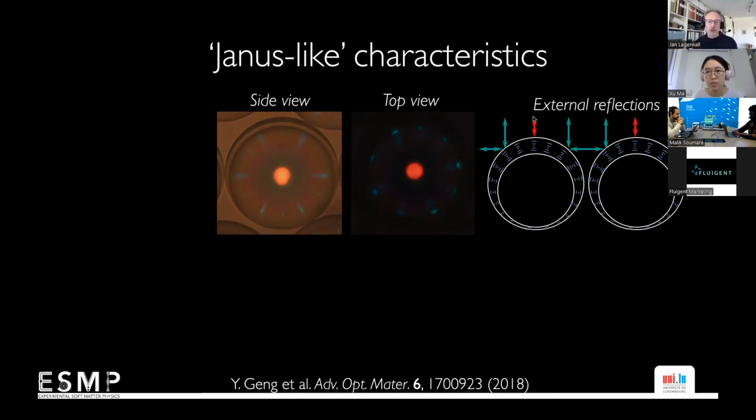That happens at the longest wavelength because it's along the helix. The helix is aligned radially, as this cartoon illustrates. But if light hits a little bit away from the center, then if it hits at 45 degrees to the surface normal, that reflection is horizontal, and then it can hit another shell that then reflects light back up too, so we see it. But now you see the angle with respect to the helix is 45 degrees. So that means that the light is blue shifted. So the color that is reflected in this way, that is blue in this case, instead of red in the middle. So that's the top view type of reflection.